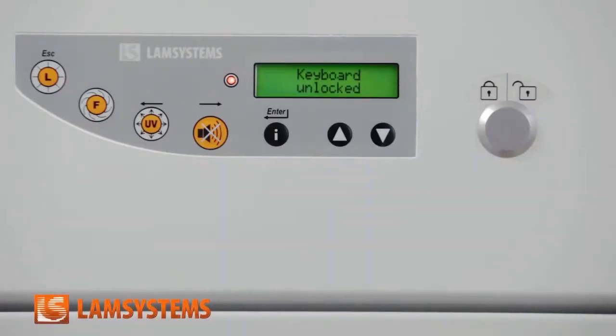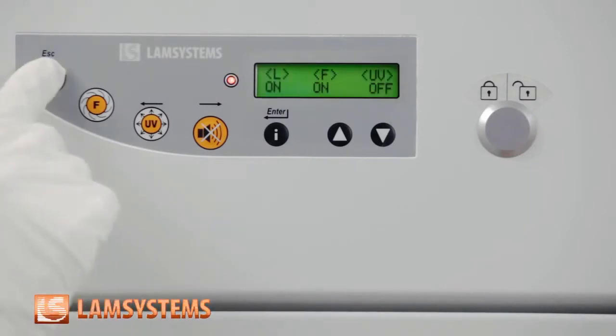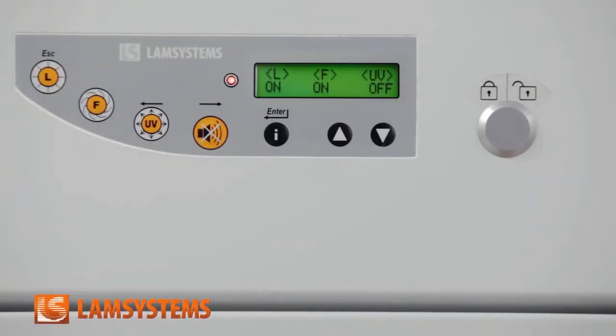Activate the cabinet using an electromagnetic key. The red light starts flashing. The control panel is active within 30 seconds and you can turn on the lighting, then the fan.